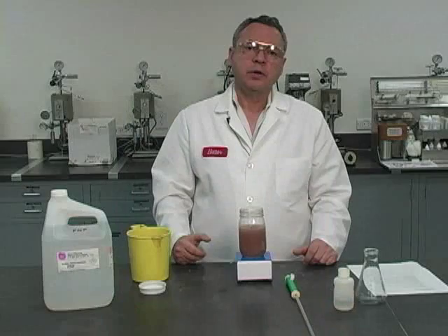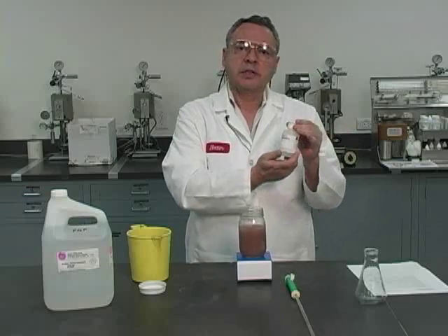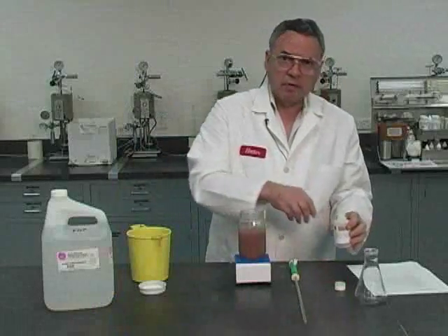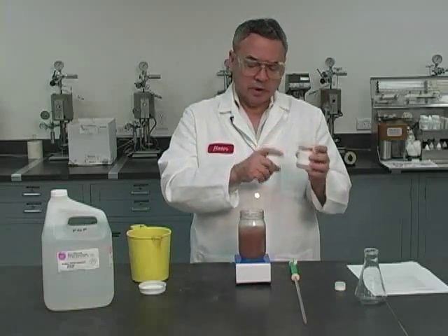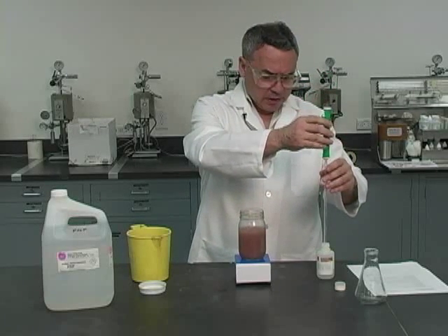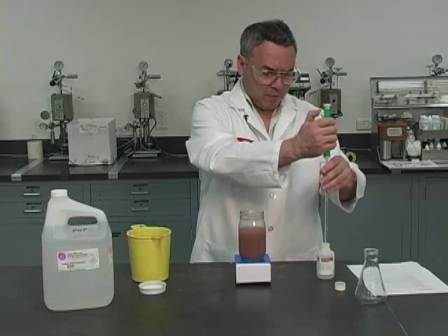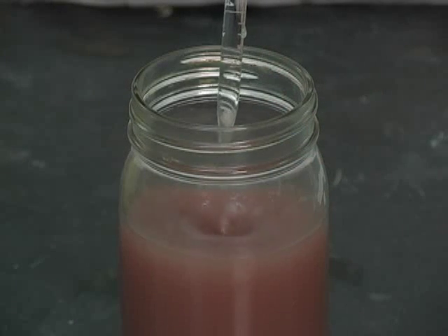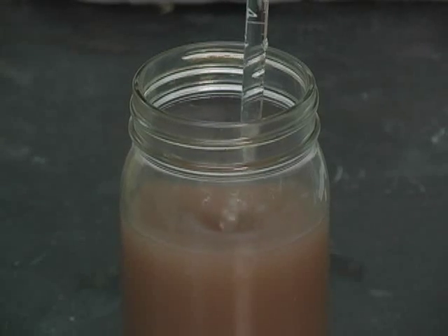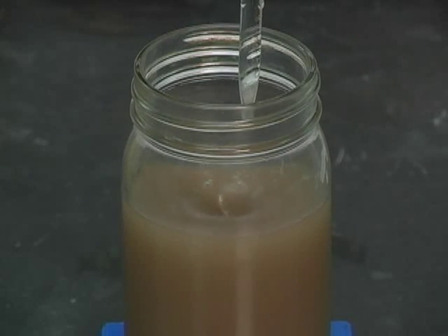And we are going to neutralize it with a 0.1 normal solution of sulfuric acid. Now I'm ready for the sulfuric. The measurement of the alkalinity of the whole mud is going to be proportional to the number of cc's of sulfuric acid, 0.1 normal, that we use to neutralize the alkalinity. I'm going to continue doing this, and the pink color has to disappear and stay off for no less than a minute. So once I reach the final point, I'm going to make sure that the pink color stays away.